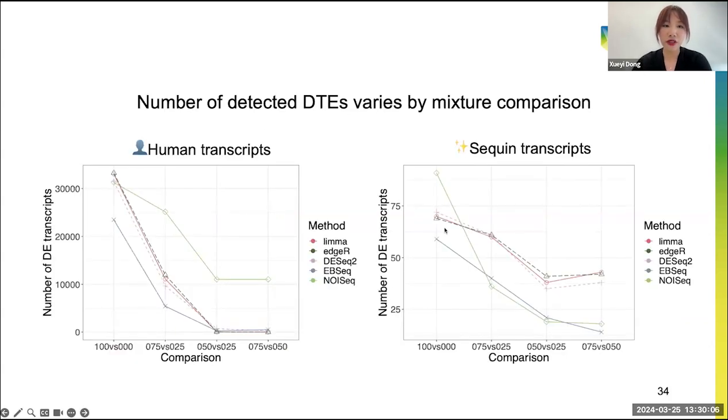And then I used the in silico mixture series to estimate the power and the accuracy of the methods. So firstly, we look at the number of DE transcripts in different comparisons.